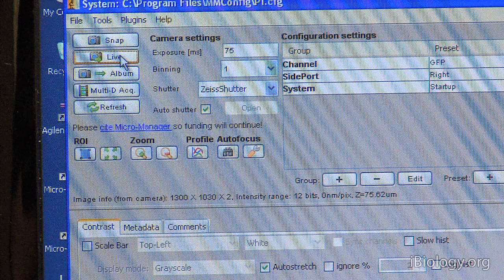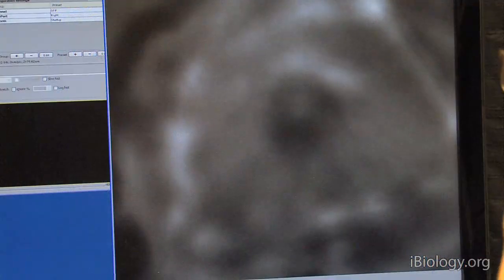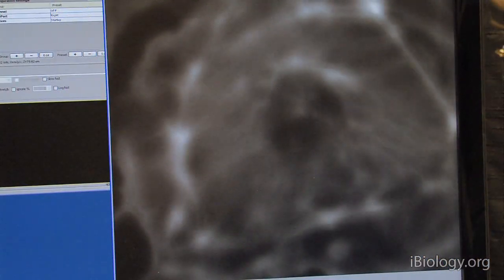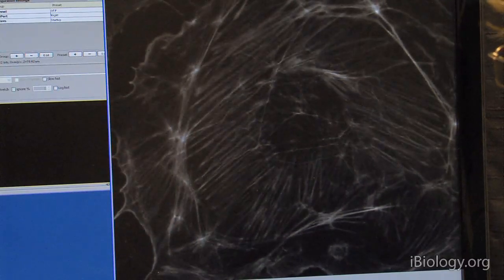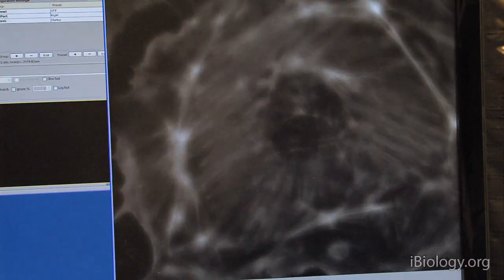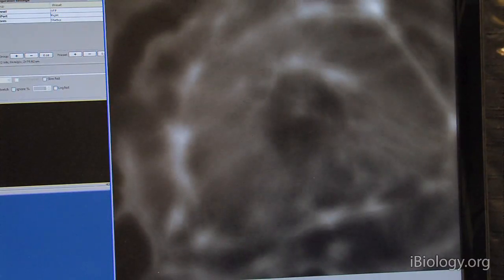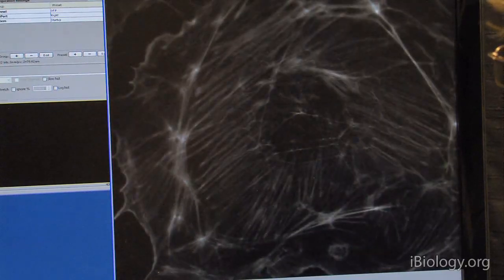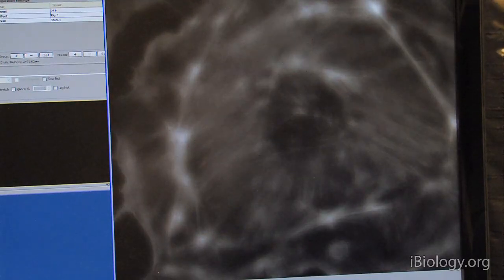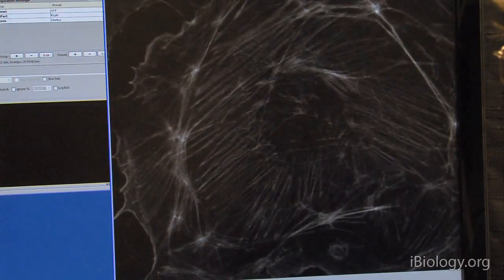A couple of other important things. We want to have a live image. So, when I press live, we get now a live feed from the camera, and that's, for instance, useful when you're focusing. I'm now moving the focus dial on the microscope. And so, this way, I can focus exactly where I want.